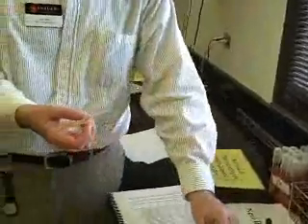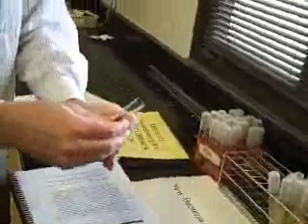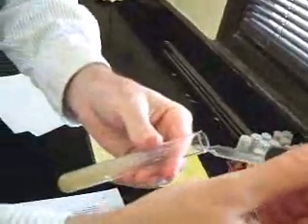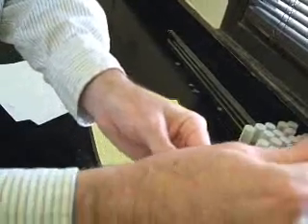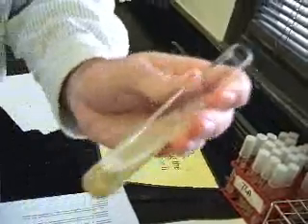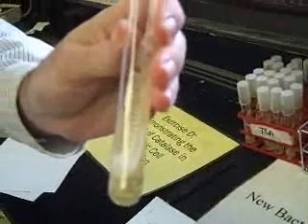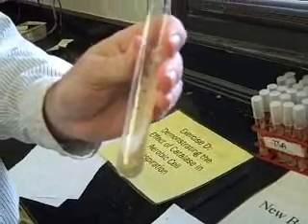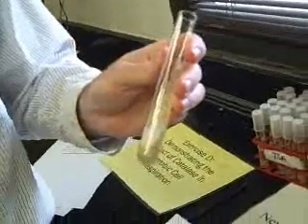We have some Bacillus megaterium bacteria. If you add hydrogen peroxide, we'll be able to see if it has catalase. Remember, there's a reaction occurring in the tube if catalase is present. You can see there's bubbles occurring in the tube. So the catalase in the Bacillus megaterium is breaking down the hydrogen peroxide into oxygen bubbles and also water. So this proves that Bacillus megaterium has catalase.